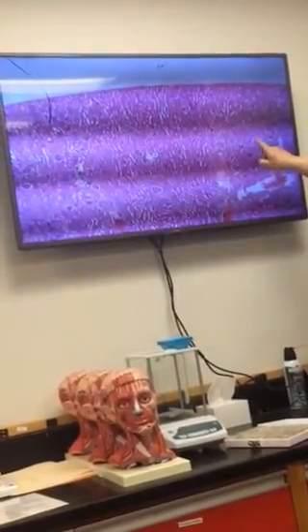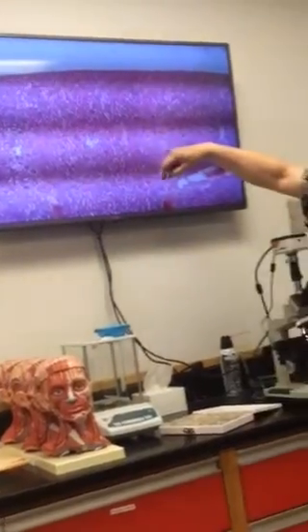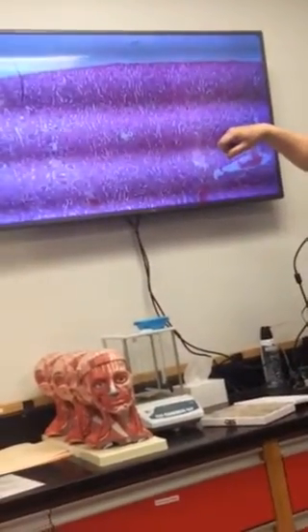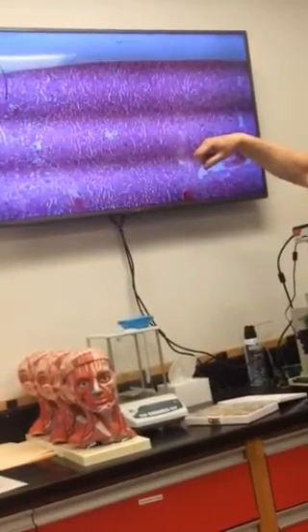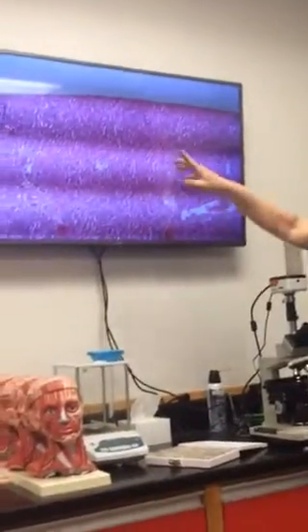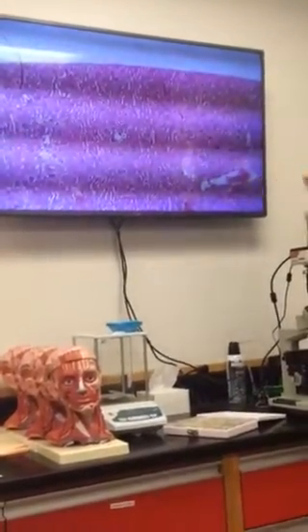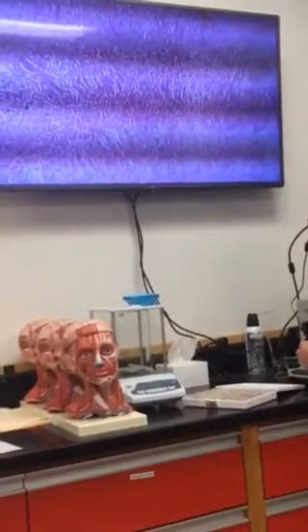nephrons. What are all the tubes that you can see around those glomeruli? Renal tubules? Well, they're part of the renal tubule, but what parts of the renal tubule? Yeah, the convoluted tubules, whether they are proximal or distal, they're going to be found in and around these areas. And then if you go deeper, what are we into now?